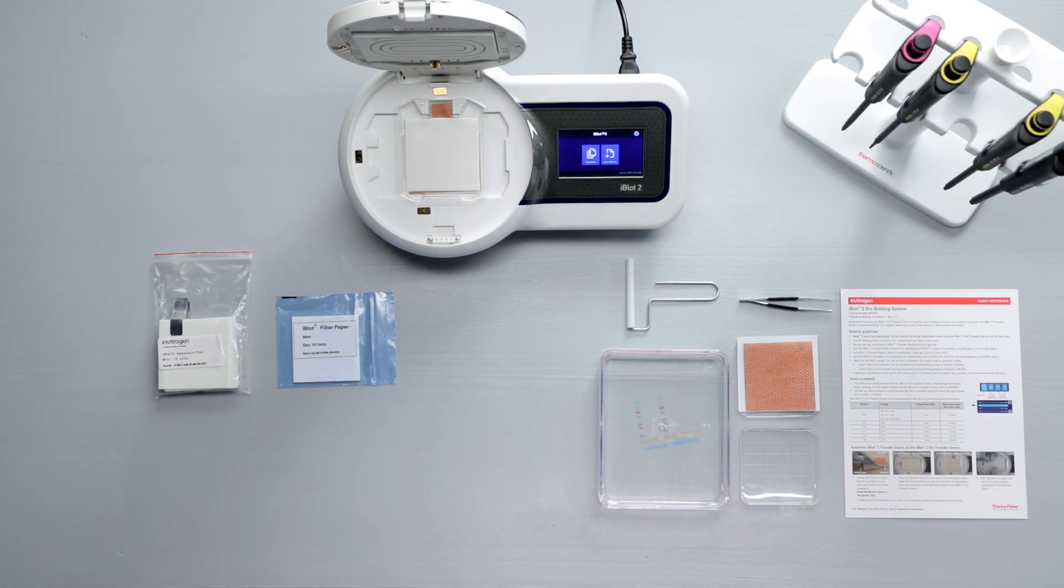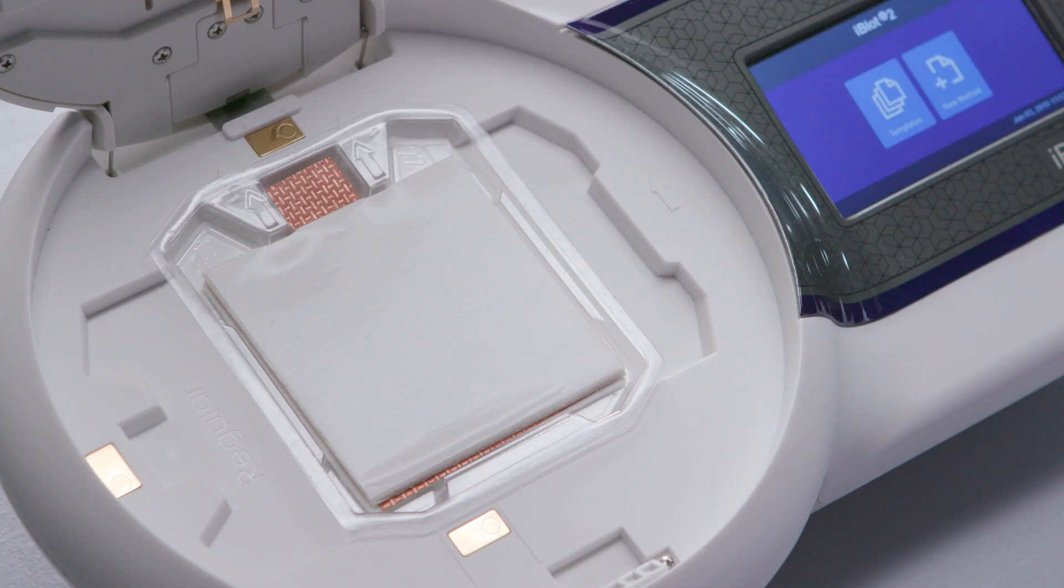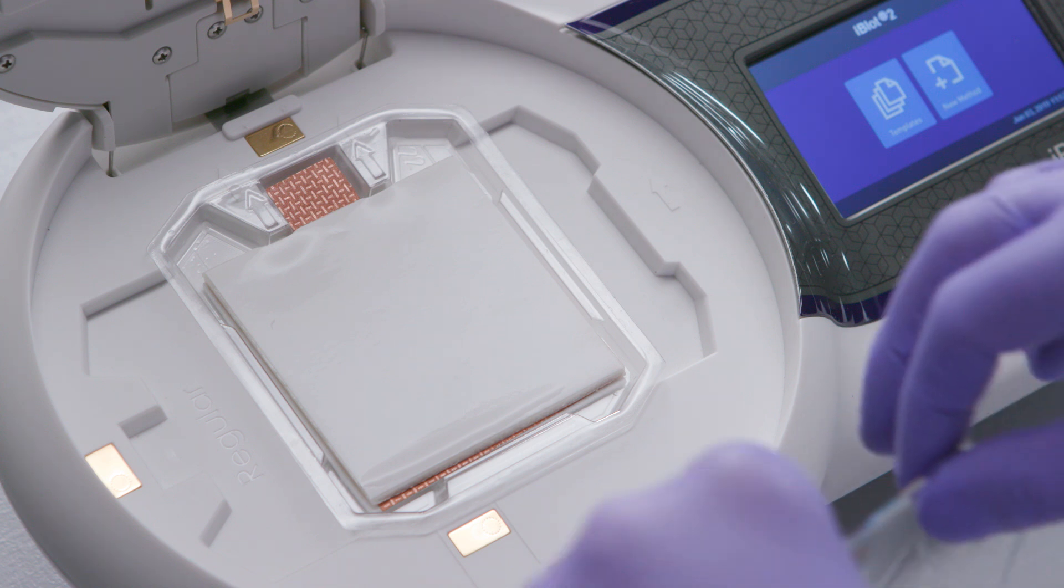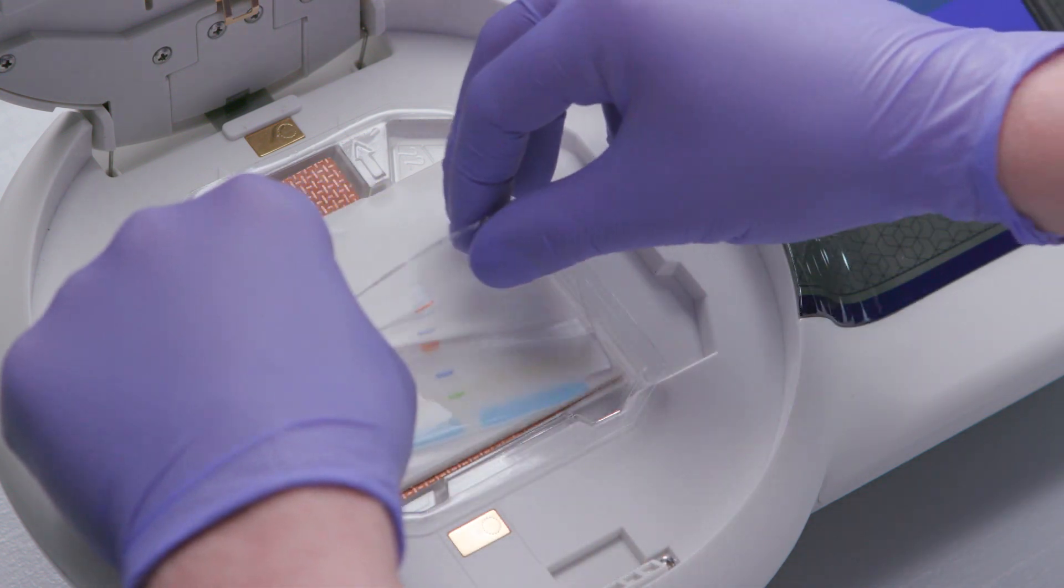Place the tray on the blotting surface of the iBlot2. Be sure to align the electrical contacts on the tray with the corresponding contacts on the blotting surface. Next, pick up your pre-run gel and place it on the membrane.